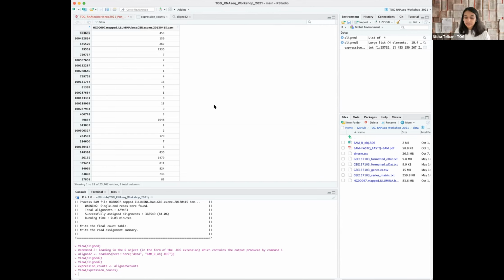Okay, so all the FASTQ trimming things that I was talking about, that is the pre-processing. So that is what you're doing. So if, let's say, there are missing counts, I don't know which gene or transcript this little ID over here corresponds to, but it says 0 counts. That means that parsing through the FASTQ file, there were no reads that were aligned for this particular gene over here. So that's why it'll give you 0. And it doesn't mean missing data. It just means that it might not be present.